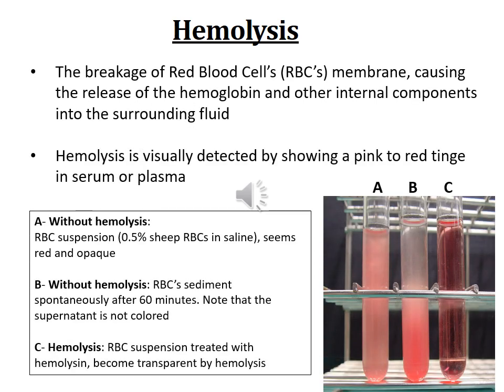Now, let's talk about hemolysis. We're actually going to be looking for hemolysis. Hemo means blood. Lysis means breaking. So we're going to be looking for hemolysis, which is the breakage of red blood cells causing the release of hemoglobin and other internal components.